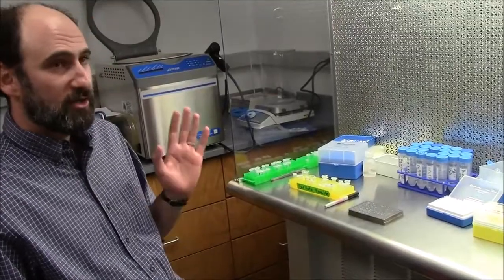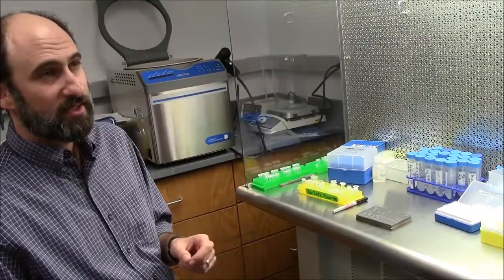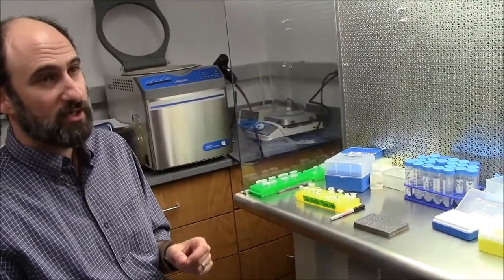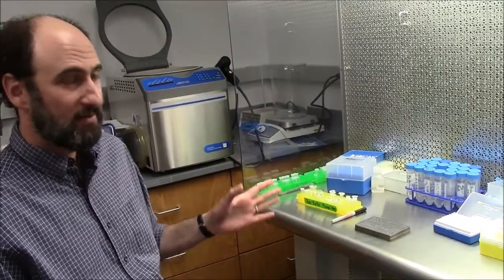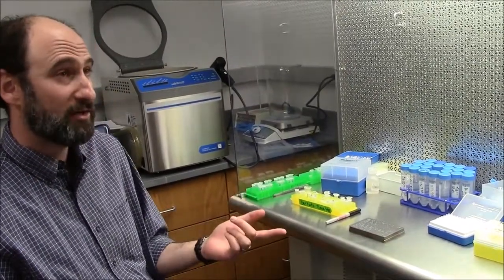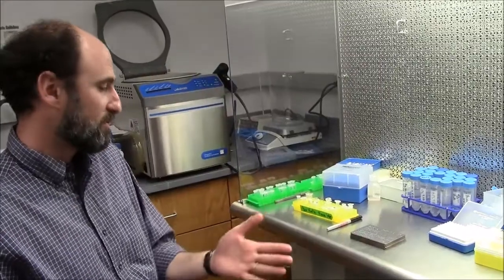Every single thing you run on MALDI, you're going to really want to optimize your spotting conditions and your concentration and then lock it in. The good thing about MALDI is everything takes about half a microliter of sample and you have a 384 well plate.